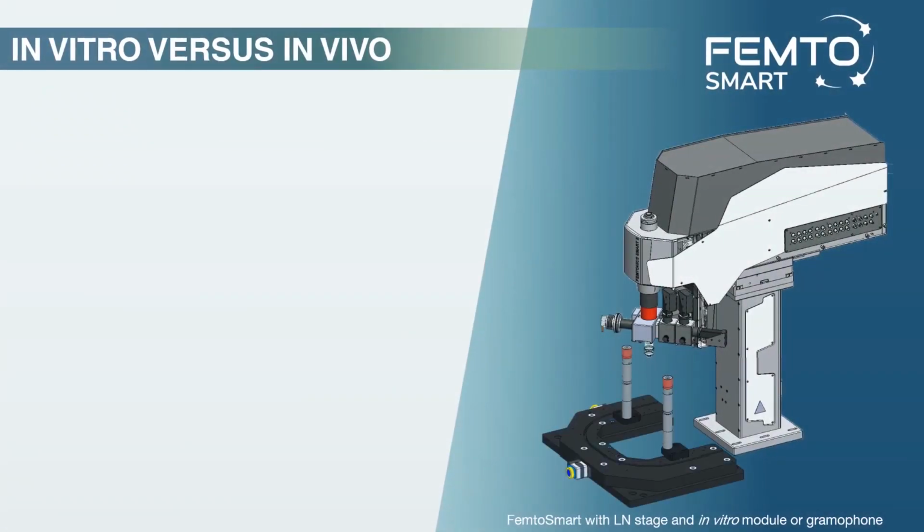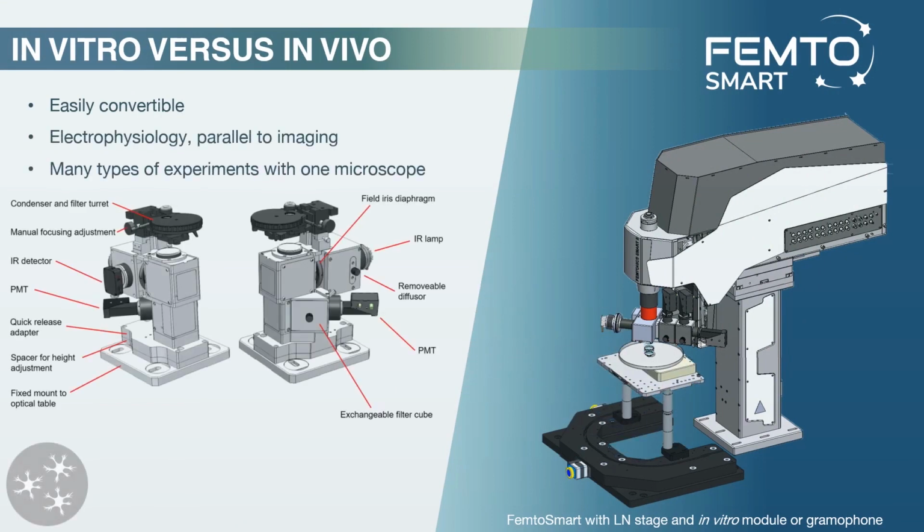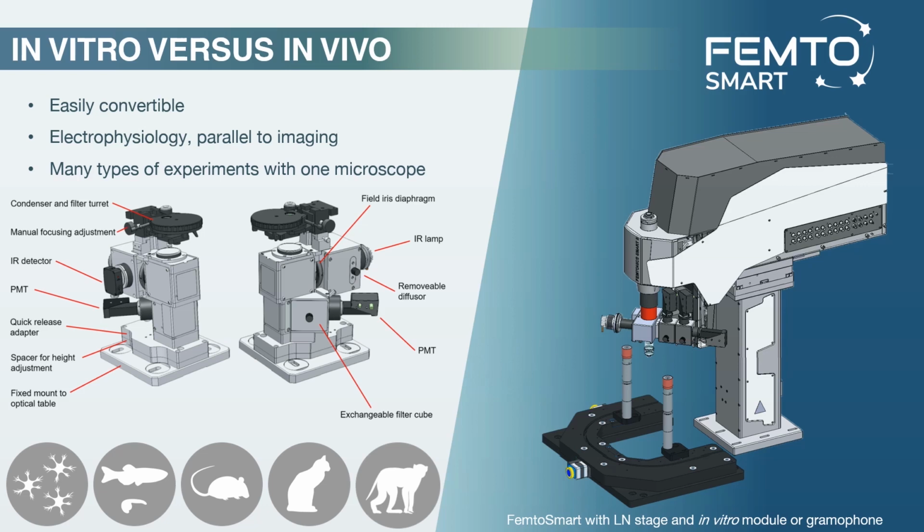The system is easily convertible for in vitro studies by introducing an in vitro platform. It transmits illumination at 840 nanometers, uses gradient contrast, and includes an oil condenser with an NA of 1.4. It can also hold substage PMTs and PMT or photodiode detection units for the transmitted infrared light to study further anatomical questions.